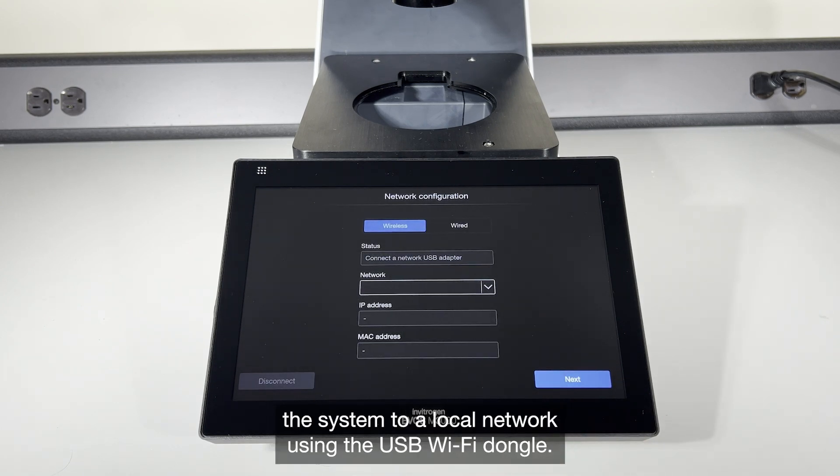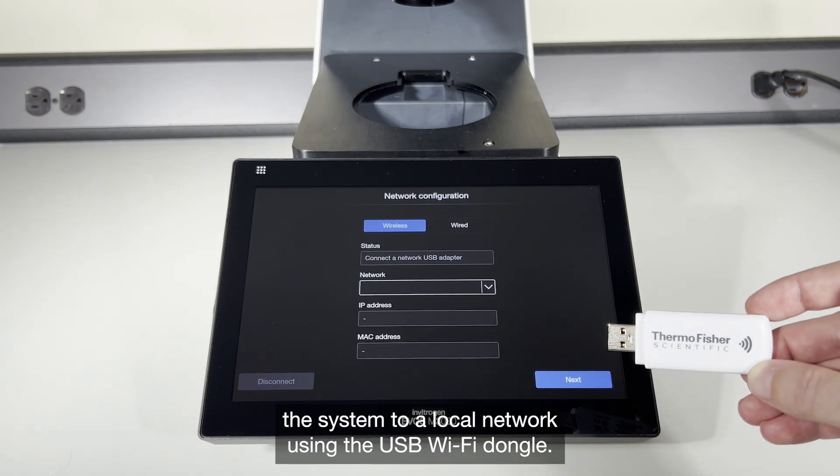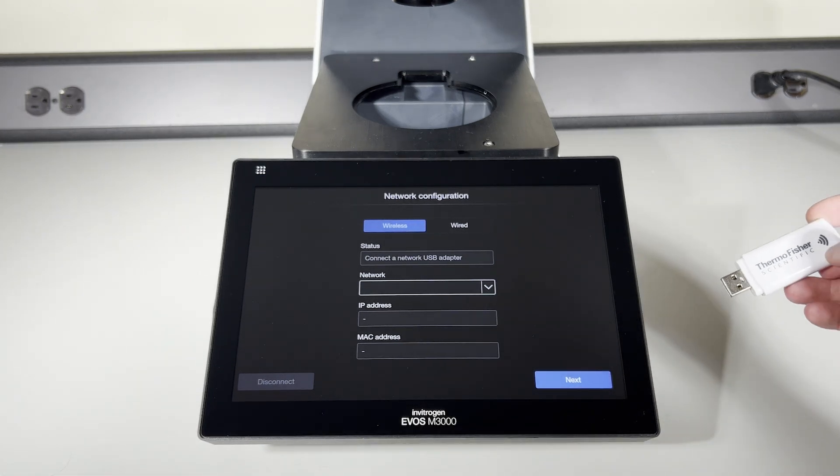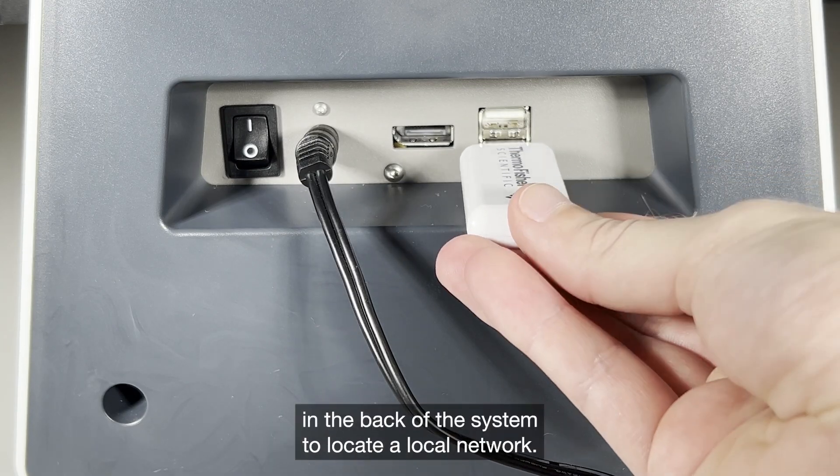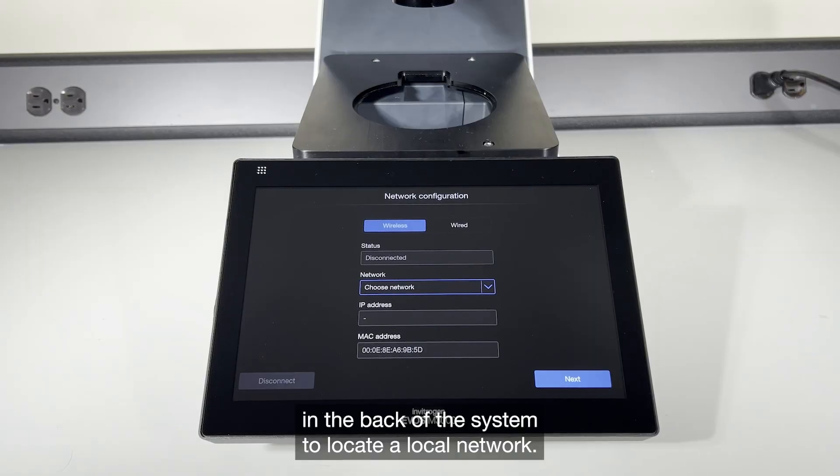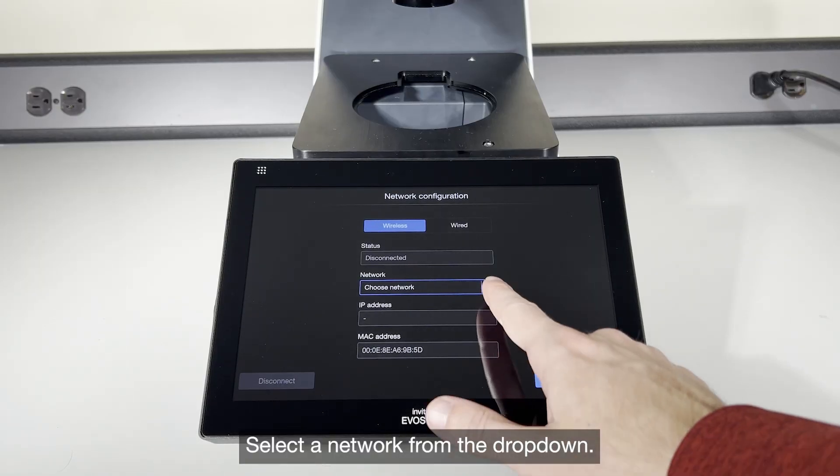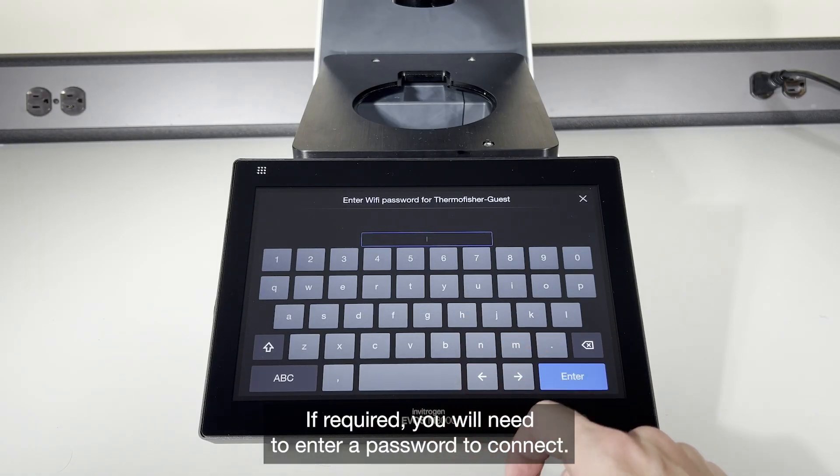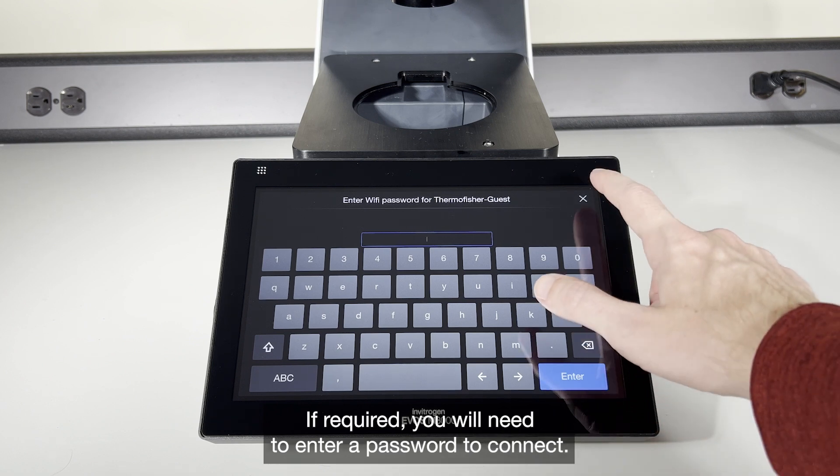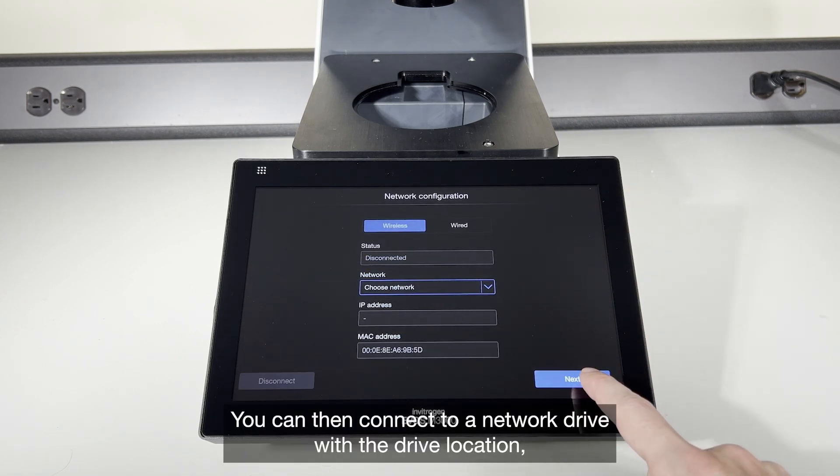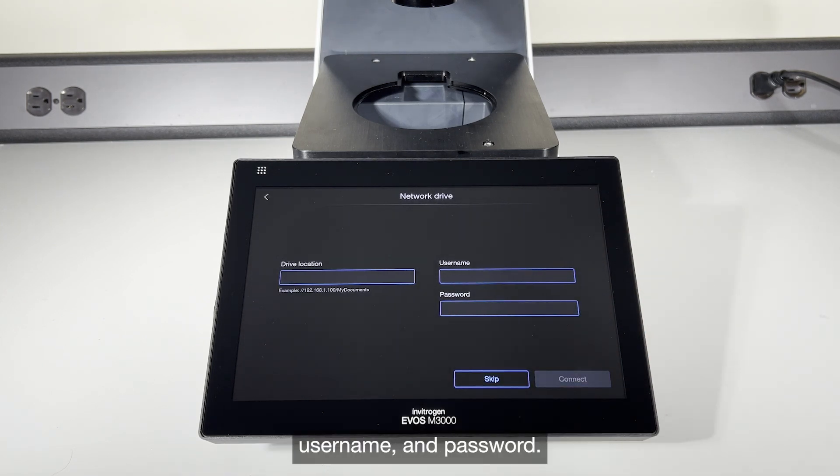Plug the dongle into a USB port in the back of the system to locate a local network. Select a network from the drop-down. If required, you will need to enter a password to connect. You can then connect to a network drive with the drive location, username, and password.